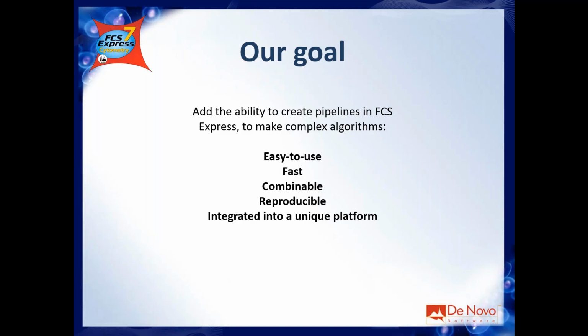I will never mention this enough. We are always implementing all the algorithms directly in FCS Express. We are not relying on any external software. We are not relying on any plugins. So everything is coded into FCS Express. This is why it's super fast.